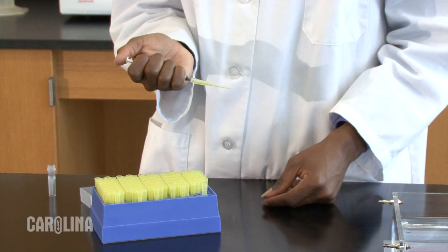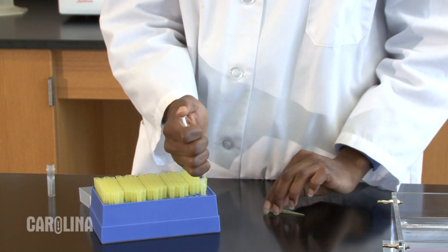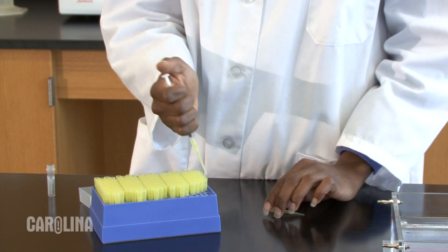One final reminder: make sure you use a new tip or capillary tube with each sample. This will help avoid cross-contamination. All of these gel loading devices, as well as a practice pipette and station kit for practicing these skills, are available at carolina.com/biotech.